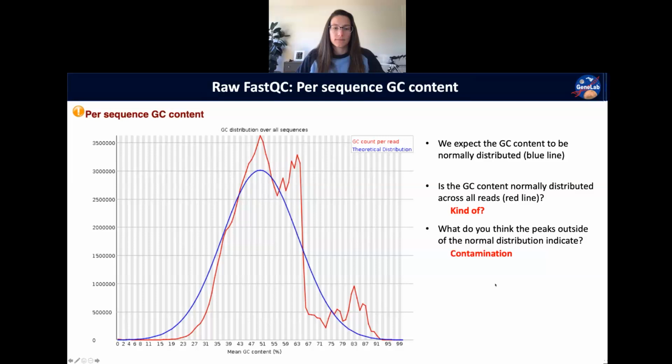Okay, so I have to tell you guys, methylation, good guess. We're actually working with RNA though. Although you are right, there is a field called epitranscriptomics, but you would have to specifically be looking for that methylation. We actually do have some data sets that have epitranscriptomic data, and that would be how you would look at methylation. This type of sequencing doesn't really show that.